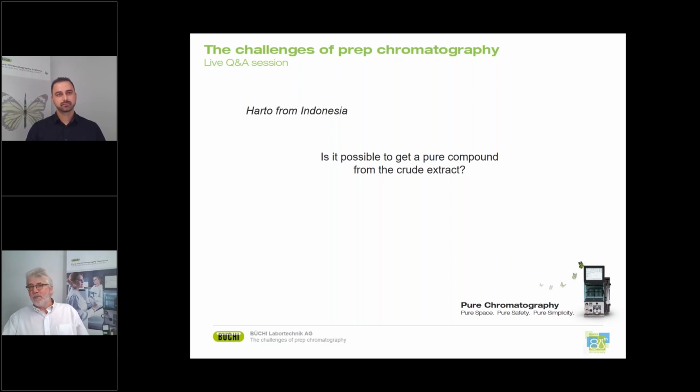So most probably pre-purifications will be needed. Removal of compound groups which only make the chromatography difficult, like already mentioned, chlorophylls which might be present, fat which might be extracted. So that has to be removed first before going to the chromatography column. Otherwise, it will really become problematic.